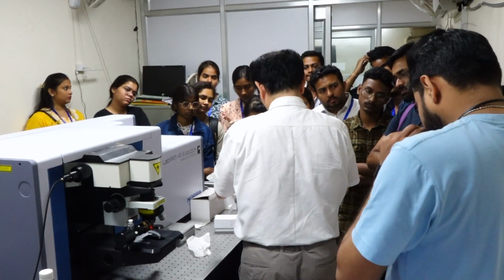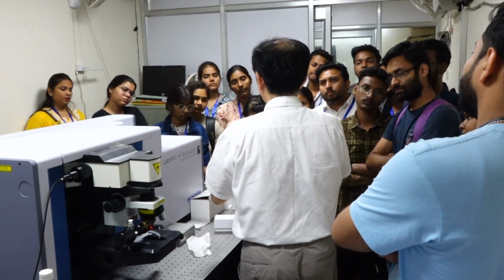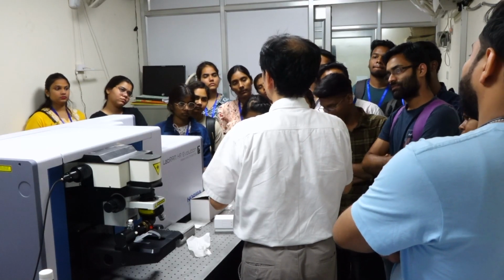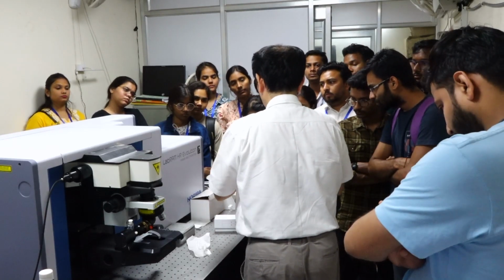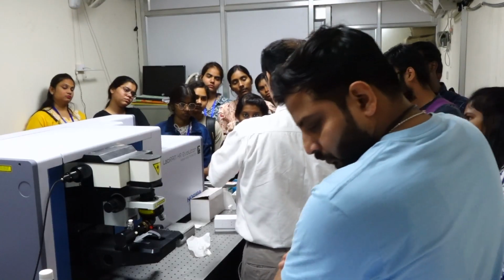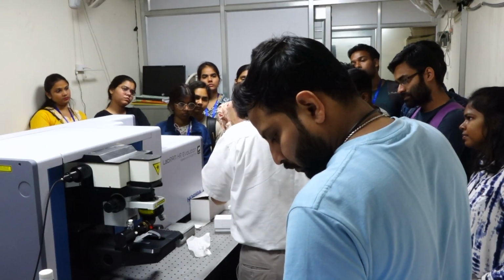But we must know strong laser beam can damage the sample. So if the sample is a solid material, such as semiconductor, it would be okay. But if we want to study the status of skin or living cell, strong laser makes it carbon burn.